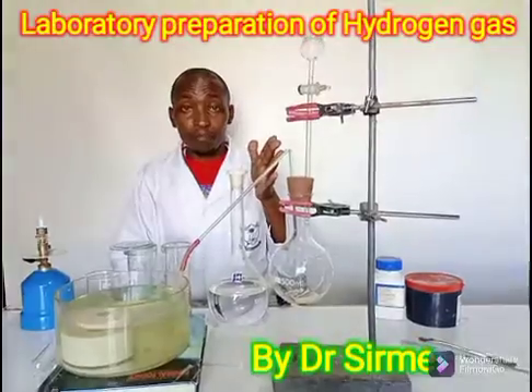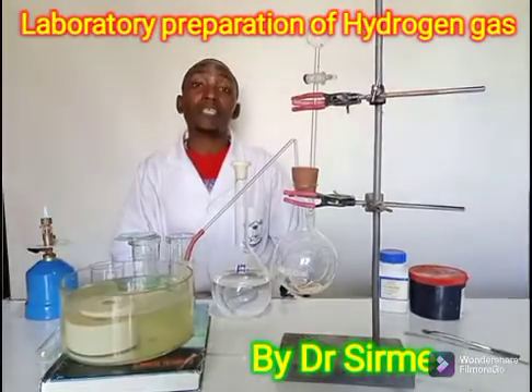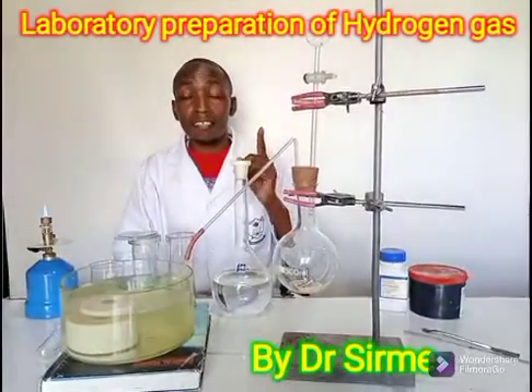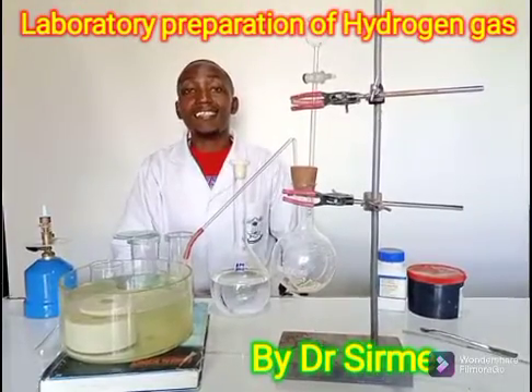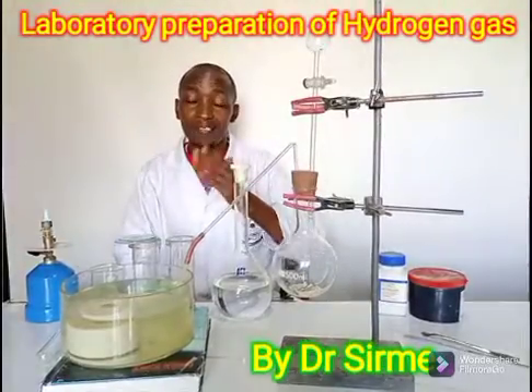Today we want to prepare another gas. Remember in one of my previous uploads we did prepare oxygen. Today we are preparing another gas called hydrogen gas. And again this is a form one work — this is under hydrogen, that is water and hydrogen.